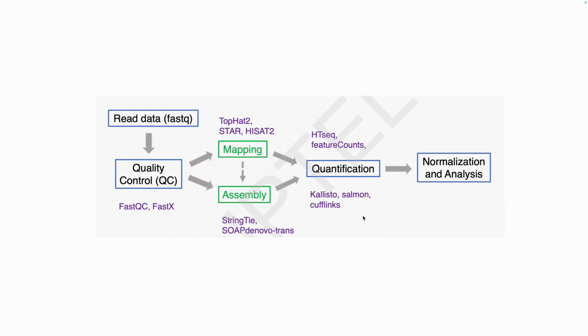So we analyze this RNA-seq data, and we quantify the raw reads that we get from both samples. Then we can compare them by quantifying the reads, and we can come up with which gene is affecting the disease condition or the normal condition. Again, these are some of the software used for quantification.